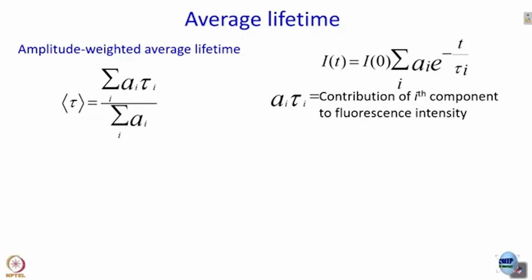But actually it is better to stop here and not get over enthusiastic and take it a little further, like say 80% of people do in fluorescence spectroscopy. So, what you see is that almost all the decays are fitted to a multi-exponential function, and everywhere people happily work with what they call average lifetime. This thing that you see, average lifetime, is sum over i a_i tau_i divided by sum over i a_i.